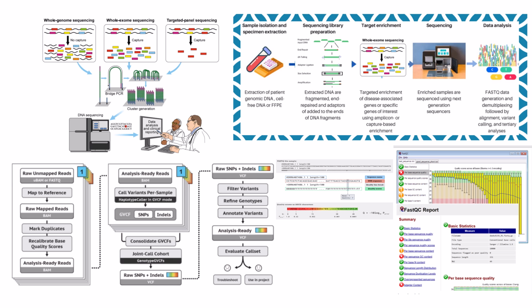And the main types of differences are? Well, the most common are single nucleotide polymorphisms, SNPs. That's just a change in a single DNA letter, like an A changing to a G at a specific spot. Okay. And the other main type is indels, small insertions or deletions of one or more DNA letters. HaplotypeCaller is designed to detect both SNPs and indels.